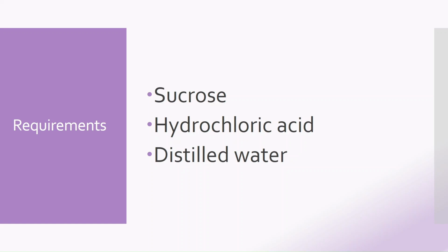In this preparation, the major active pharmaceutical ingredient is going to be sucrose, and the rest are excipients that we add. We will see their role, what exactly they perform in the preparation, and why it is necessary to have each as a requirement.